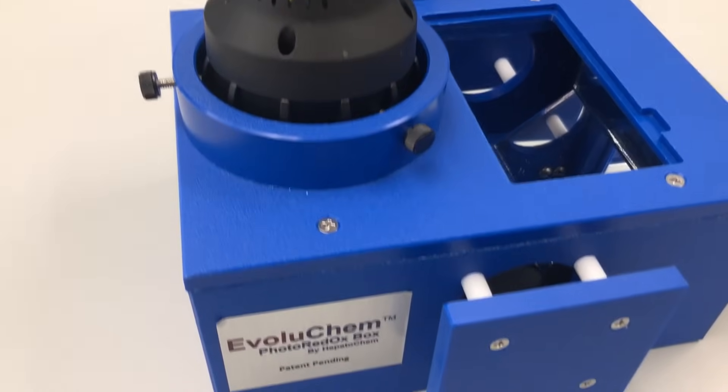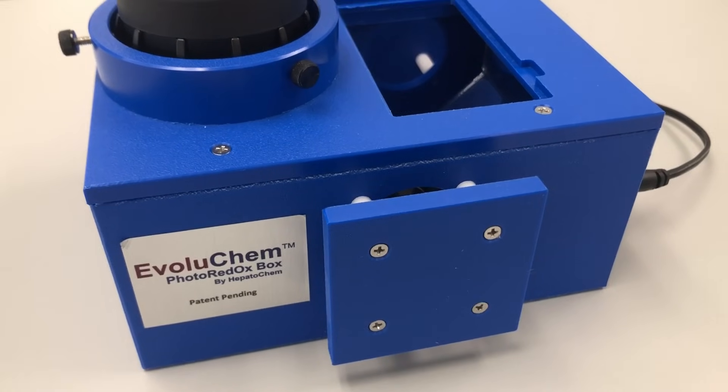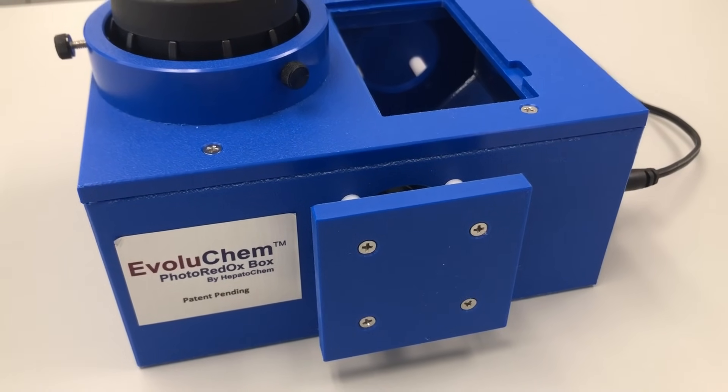The EvoluChem Photoredox Box, our original photoreactor, was designed with the goal of providing the most efficient and most flexible photoreactor on the market.